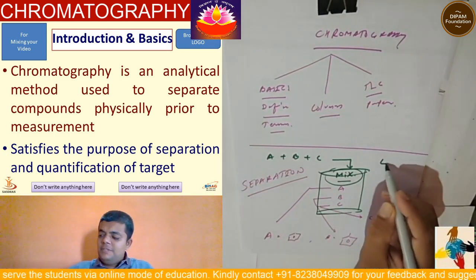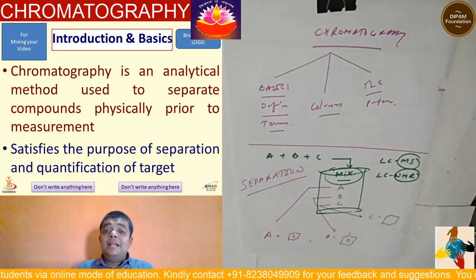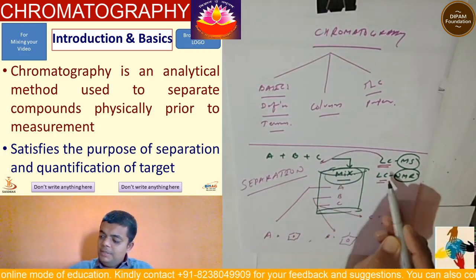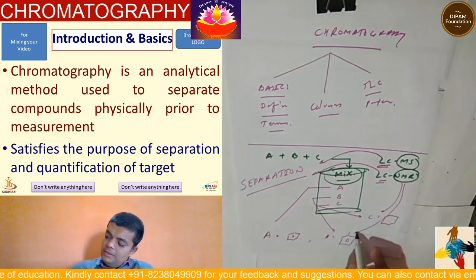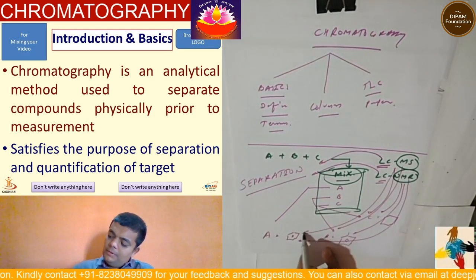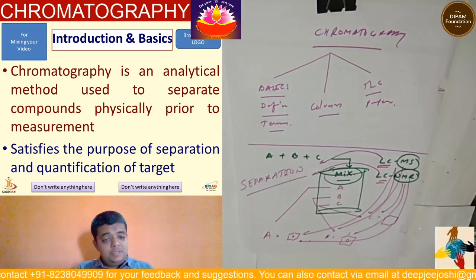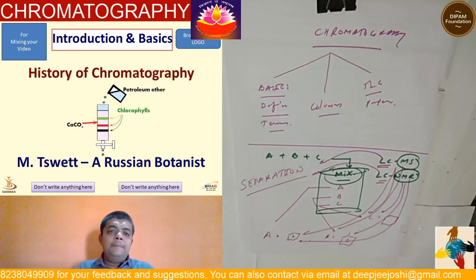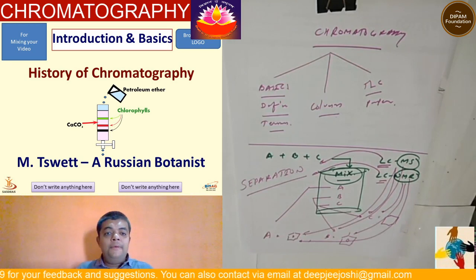And yeah, afterwards, if you say it is mass spectra or you say it is NMR, LCMS or LCNMR nowadays, then this LC, that is liquid chromatography, is something that is used for separation. And this profoundly can be used for identification. So it is a separation technique. As told, in chromatography, we'll just first look at this beautiful experiment on the board.